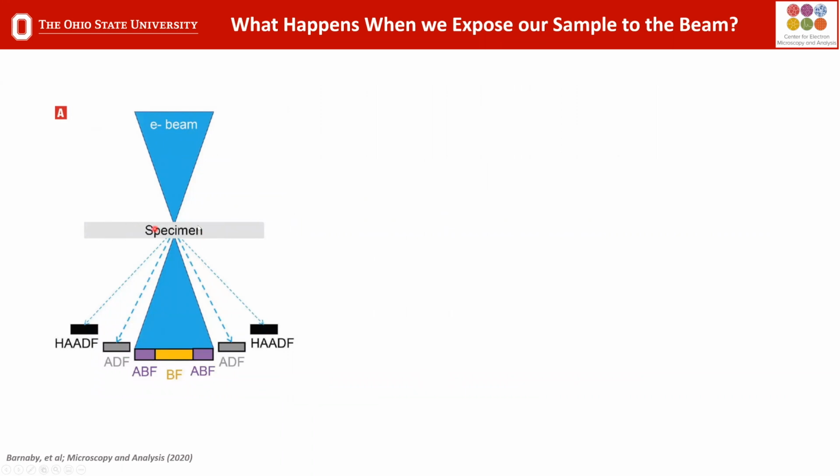But so I alluded to having this thin specimen, and in a microscope, in the condition we're using it in, STEM, what we want to do is take our electron beam and converge it down to a point. And so we have electrons and we try to make them into as small a point as possible. And what the Themis provides is a probe corrector. And that allows us to get this point as small as possible. And if we have a small probe, now we can move that probe across the specimen, right? Left and right, back and forth. And when that happens, the beam is going to interact with the specimen. And the way the beam is scattered, or the result of what happens to that beam when it interacts with the specimen, is very much dependent on the characteristics of the specimen, right? And so that's why we do the work we do.